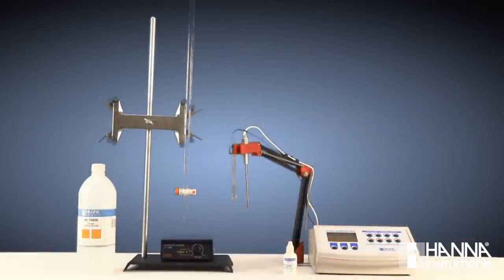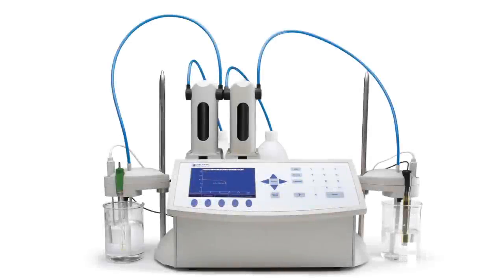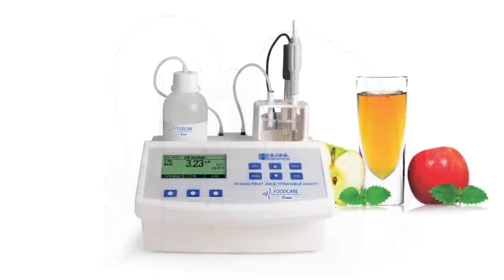In addition to pH meters and electrodes for manual titration, HANA also manufactures automatic titration systems, including our research-grade potentiometric titrator, the HI-902C, as well as an industry-specific line of mini titrators, which includes the HI-84432, the mini titrator for acidity in fruit juice.